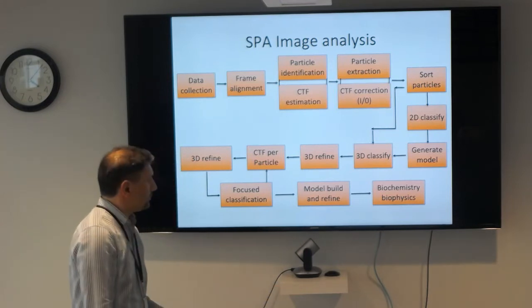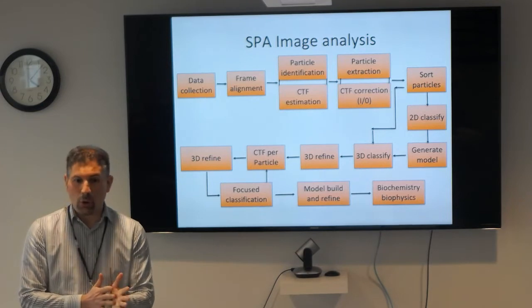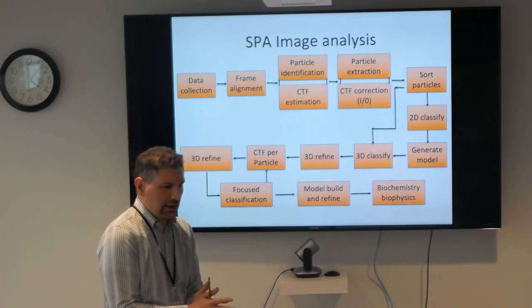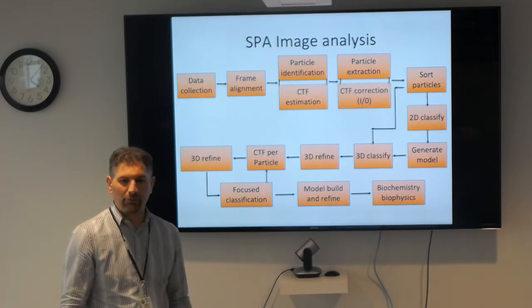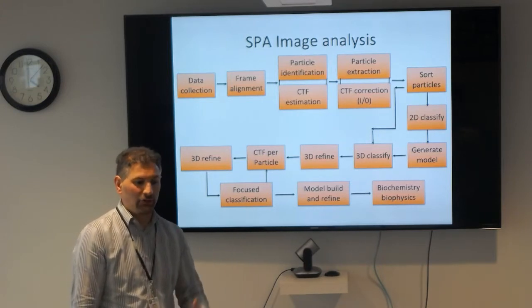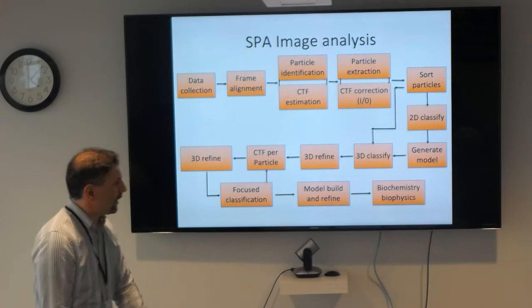Doesn't that also hold for membrane proteins, where it's over-aligning on a micelle? Yes, you can use it to classify that way as well. Focused classification is essentially using a mask to classify in a particular region, and you can get creative with it and use it for many different methods. It's just a tool, so you don't have to restrict yourself to conformational or configurational variability. Use it for whatever your creativity allows. That's how all of these things are.